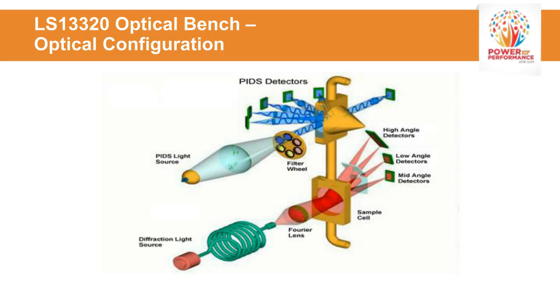And utilizing this fiber optic cable allows a very clean signal, because what you're trying to create is a very clean signal from the laser and a very stable signal. And so this allows for great help in being able to, if one is needed, actually put a new laser in a system in the field without any problem.